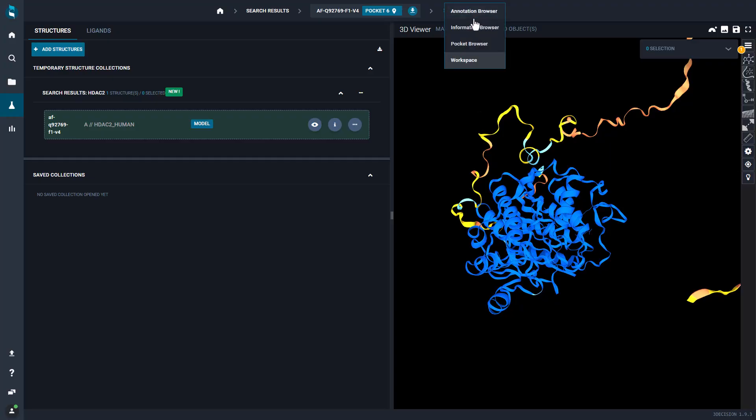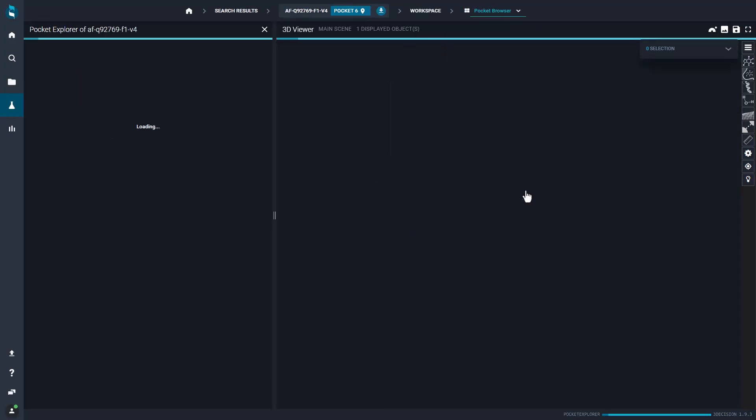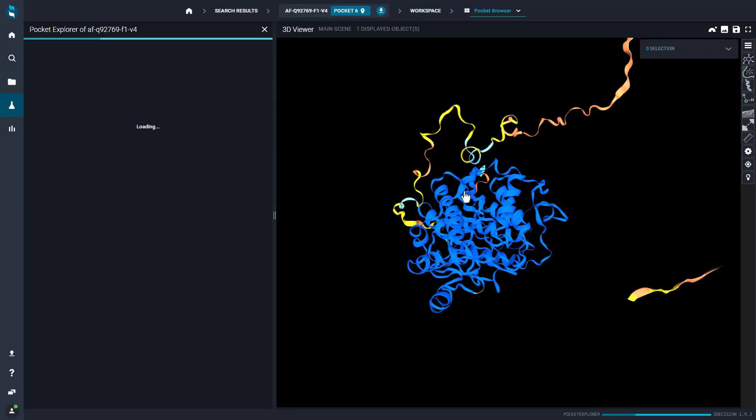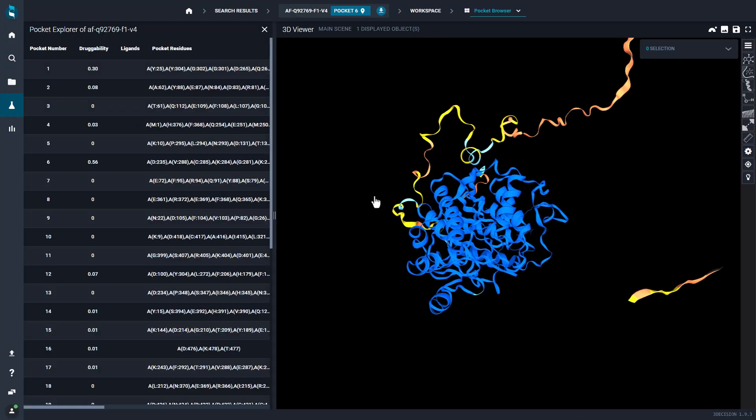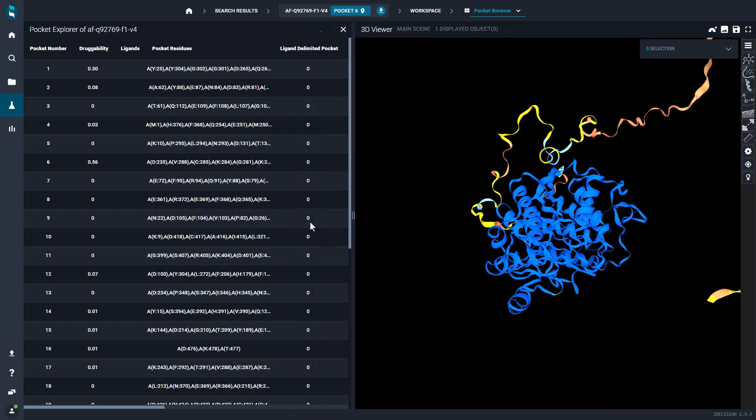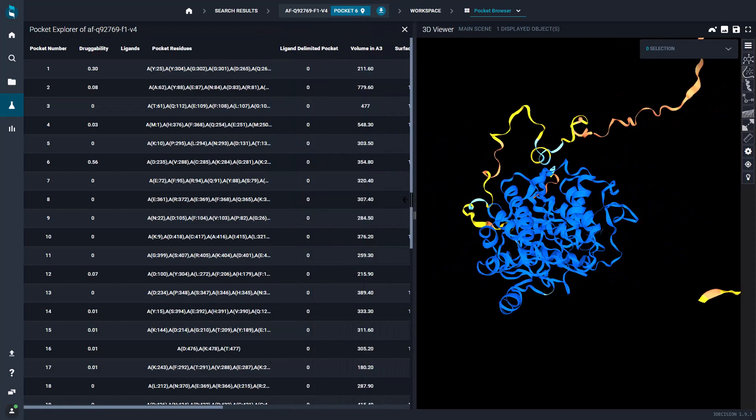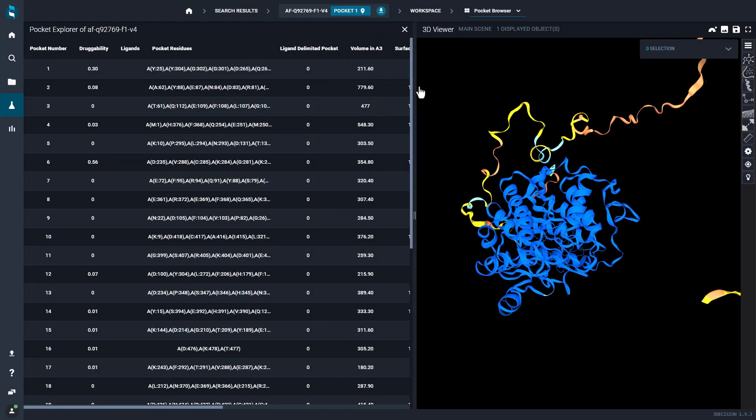AlphaFold structures are processed in 3Decision like every other structure. So, for instance, you can explore all the predicted pockets on the protein surface.